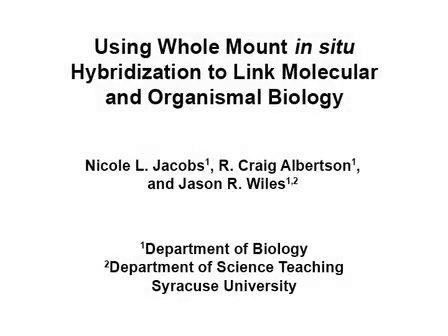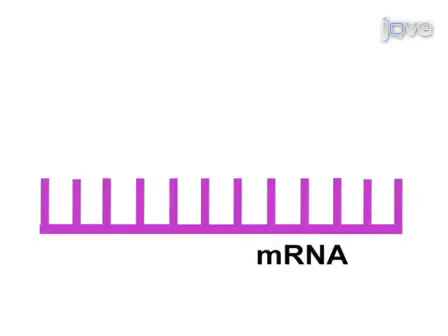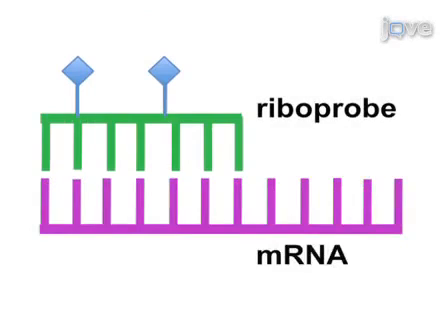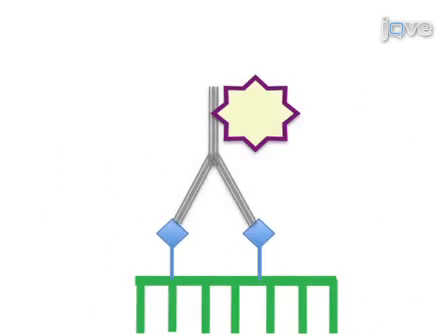The overall goal of this procedure is to observe patterns of gene expression in zebrafish embryos during specific stages of development. This is accomplished by first hybridizing a digoxygenin-labeled antisense riboprobe to the mRNA of interest. The second step is to detect the riboprobe using an antibody for digoxygenin. The antibody is conjugated to an alkaline phosphatase enzyme.